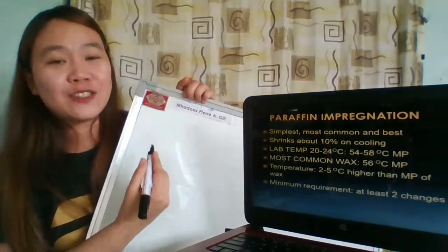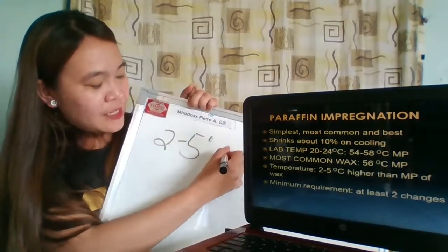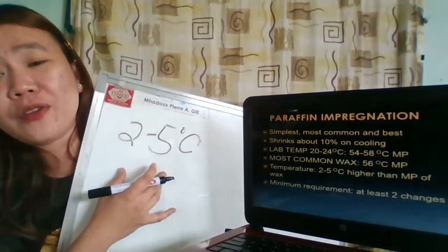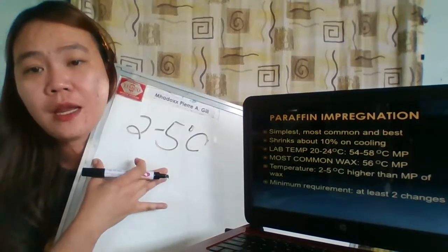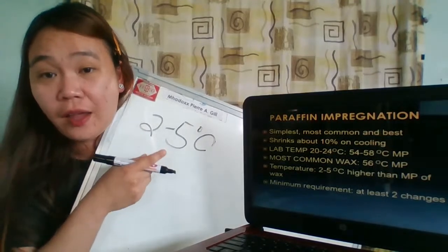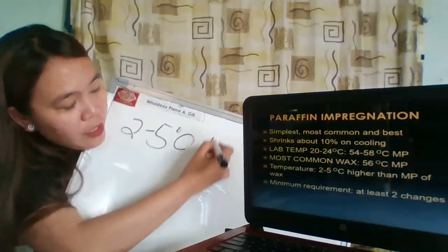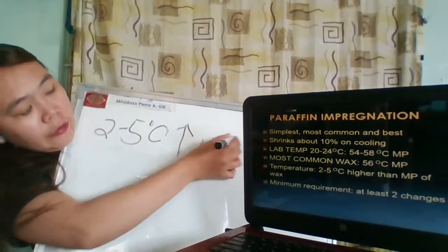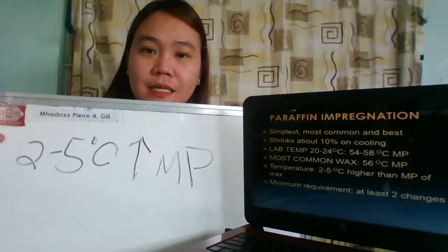Anyway, for the temperature, 2 to 5 degrees Celsius higher. Please have mercy, I don't have to write, but you have to write. So, 2 to 5 degrees Celsius higher than the melting point of your wax.